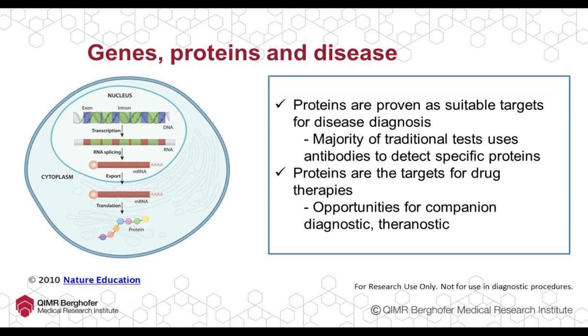And there are many tests now that actually use proteins. Between the gene level and the protein level, there are many different steps, and there are many studies now that report they don't directly translate. So indeed, there is a real need to directly study proteins. Furthermore, there are many modifications that occur at the protein level that cannot be predicted from the genome or the transcriptome. So there is an actual need.